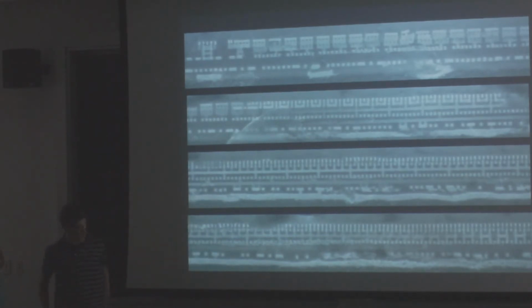And what this really showed us was these chips are designed on an incredibly integrated level as far as their 3D structures, because you can see that there is some really neat 3D architecture going on here, because we were able to cut through different layers that are very small distances apart and see totally different features, but yet you can tell that they're all part of the same structure. So we were just really amazed at how much architecture there is in these chips.